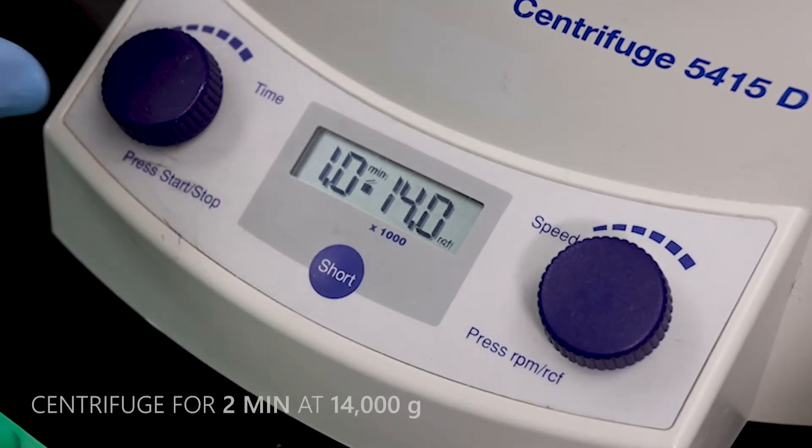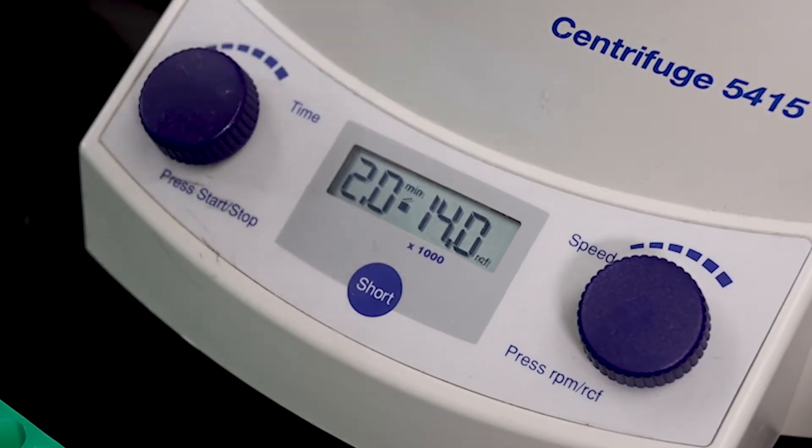After discarding the flow through, centrifuge the spin column for 2 minutes at 14,000 G to dry.